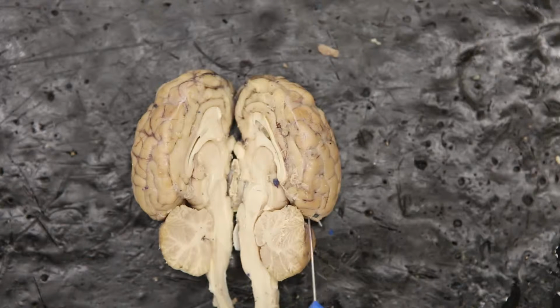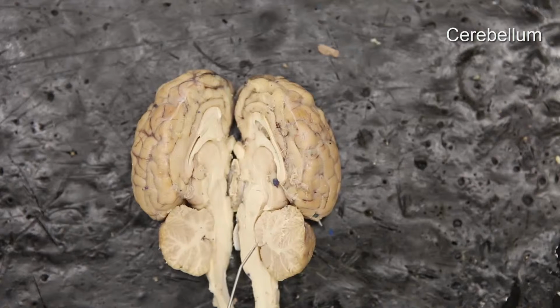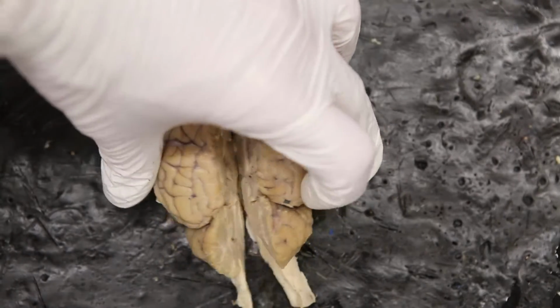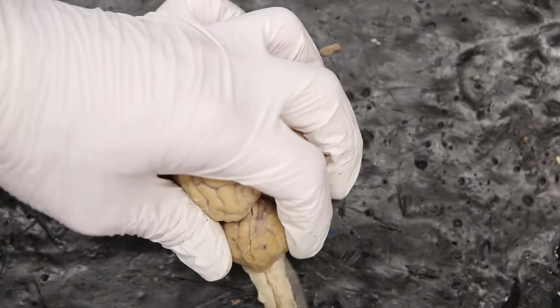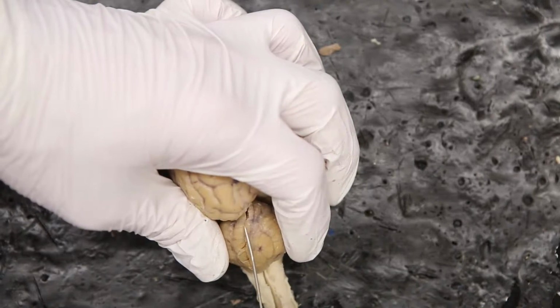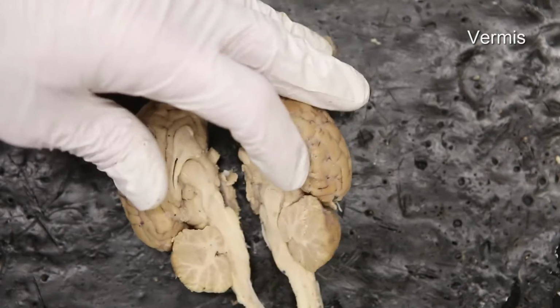The entire structure back here is known as the cerebellum. On the cerebellum, you can see this white matter, these kind of branches coming out. Those branches are known as the Arbor Vitae. They're going to be the white branches going out. If we put the cerebellum back together, this central section that we cut open is known as the vermis.